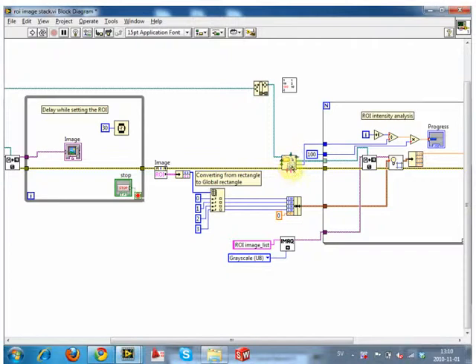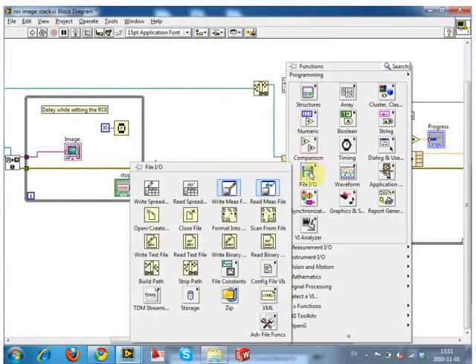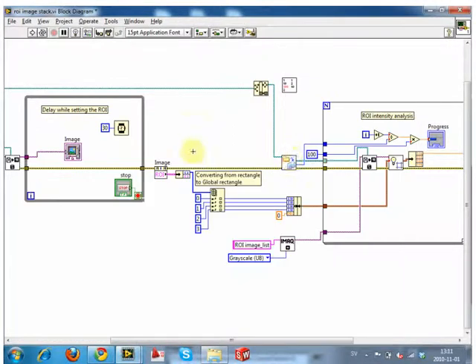This is an inbuilt Labview VI from, I think, 2008. It's quite a recent addition. Before this one came about, the one that everyone's always been able to use is this one. It's a low-level VI, and all it does is list what's in the folder. It has no level of sorting or filtering or anything else. And then they came out with this one to try and make things a little bit easier.